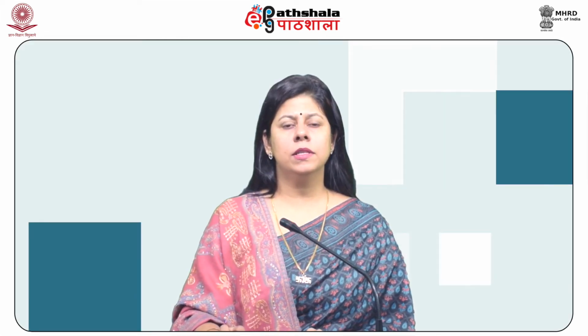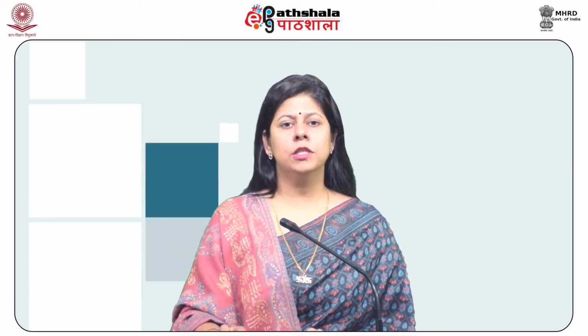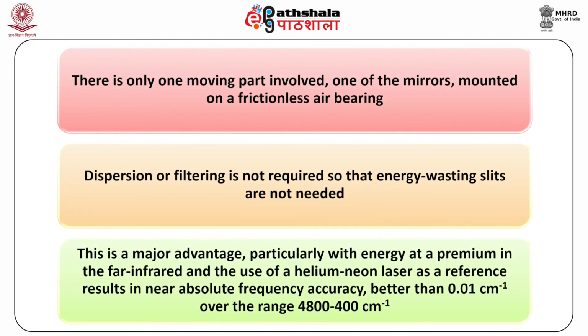This technique has several distinct advantages over the conventional dispersive techniques. There is only one moving part involved, one of the mirrors, mounted on a frictionless air bearing. Dispersion or filtering is not required, so that energy wasting slits are not needed. This is a major advantage, particularly with energy at a premium in the far infrared, and the use of a helium neon laser as a reference results in near absolute frequency accuracy, better than 0.01 centimeter inverse over the range of 4800 to 400 centimeter inverse.